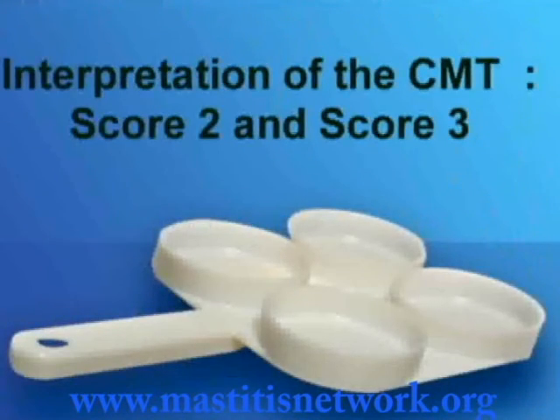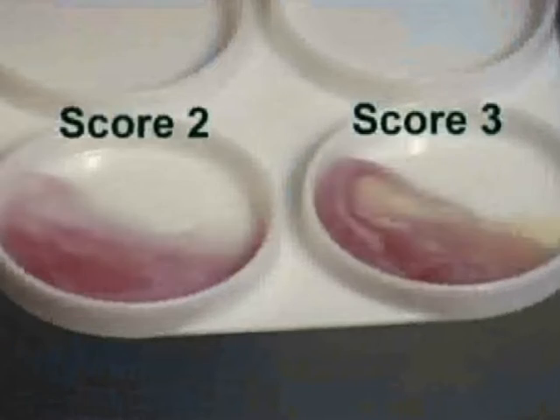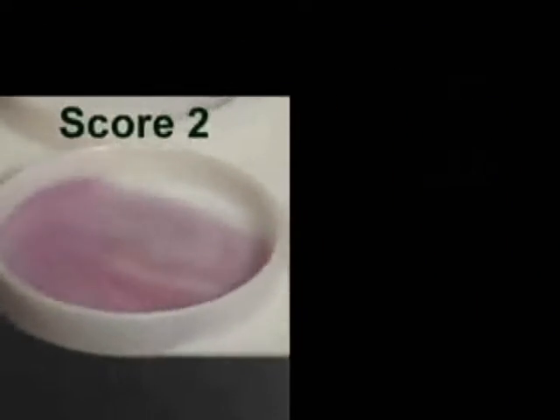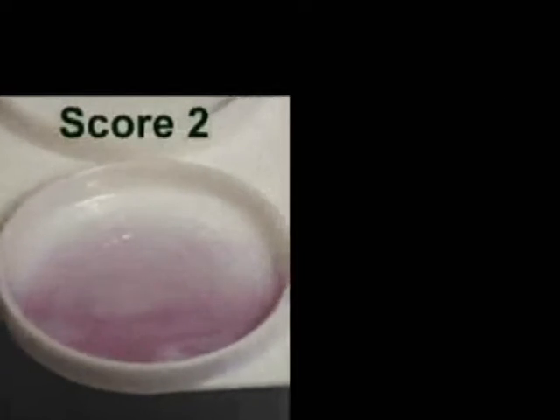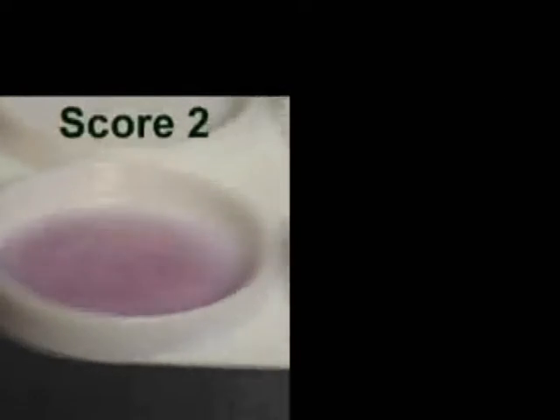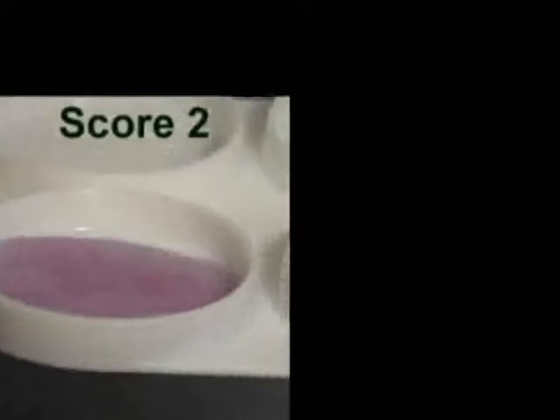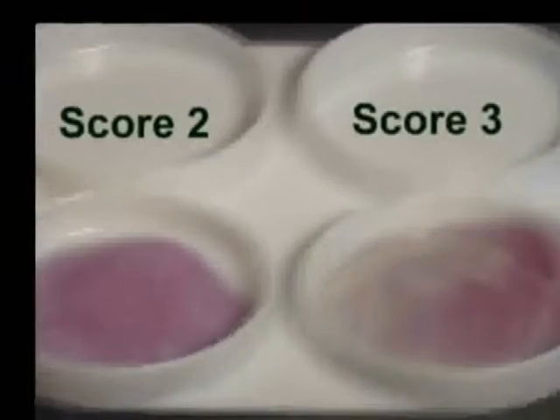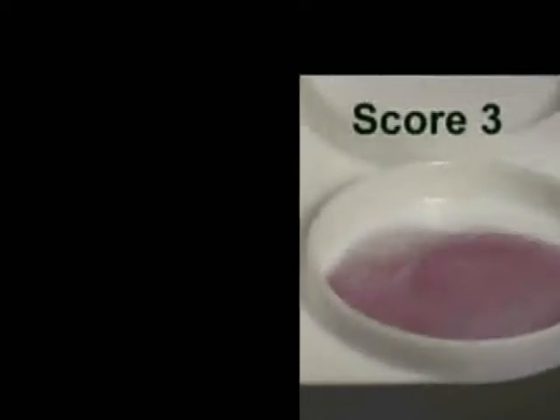Finally, score two and score three reactions. The cup on the left shows a score two reaction, which means that it is clearly positive. During the rotating movement, you can see some gel formation slightly rounded in the center of the cup. When the rotating movement is stopped, the gel collects at the bottom of the cup. The cup on the right shows a score three reaction, which means a strong positive. In this case, you can see a gel formation sharply rounded in the center of the cup. The gel sticks to the bottom of the cup, but not to the sides.